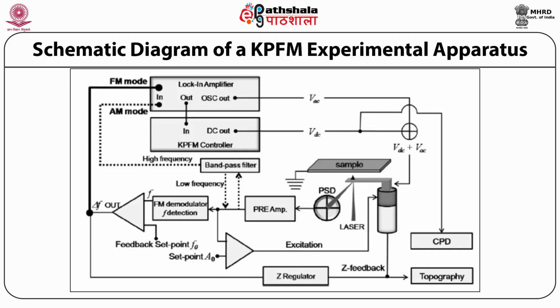Electronic property of defect on clean semiconductor surface have been investigated using sub-nanometer resolution KPFM. High resolution KPFM has been successfully applied to the study of a variety of adsorbate and their interaction with semiconductor surface. Point 3. High resolution KPFM has been used to probe semiconductor device.